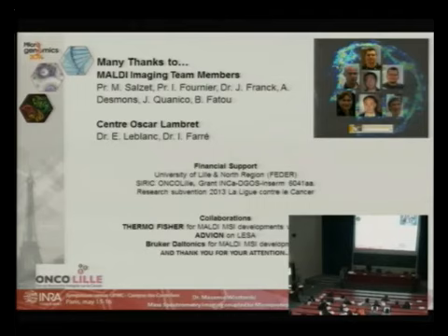Yeah, we extract through 12 micrometers around, and what is great is that you can remove the matrix and afterwards perform another analysis, because you can use different types of matrix depending on the molecules you want to analyze, and you can obtain different types of information with the same tissue.